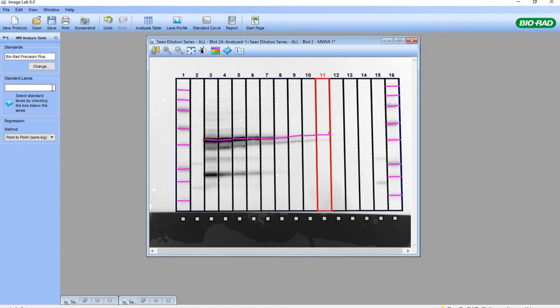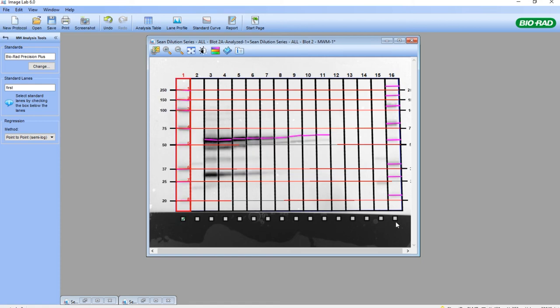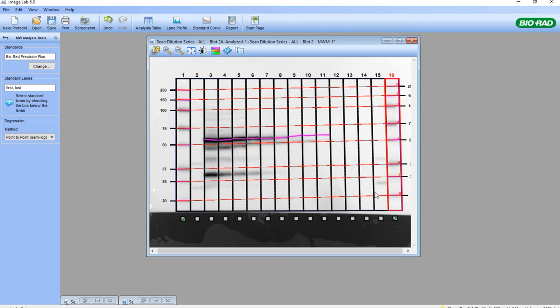The tool gives us instructions — every tool gives instructions on what to do. Select the standard lanes by checking the box below the lanes. It will always ask if redetection of the existing standard bands is required. If you use the method I've shown here, the answer should always be no, because you've already pre-selected them and assessed them with the lane profile tool. I'll select both marker lanes and say no to redetection. Now you can see that each molecular weight in the marker has aligned itself for the opposing molecular weights in the first and last lane, to get more accurate molecular weight analysis.